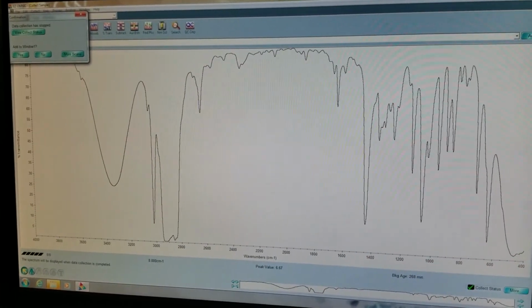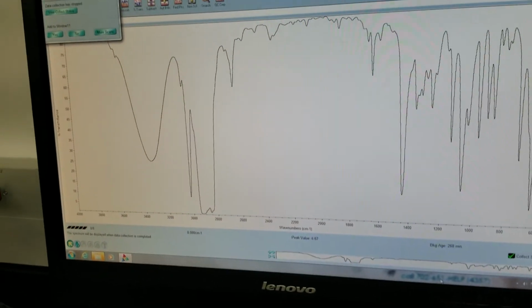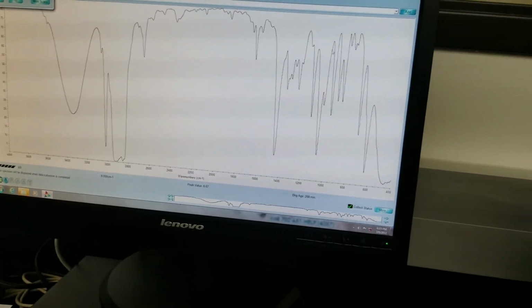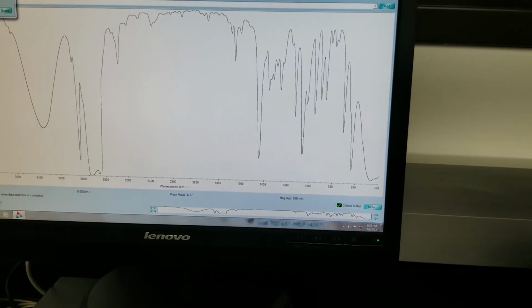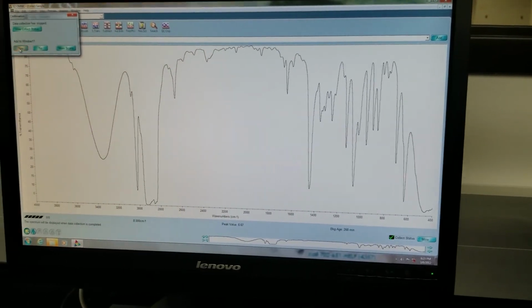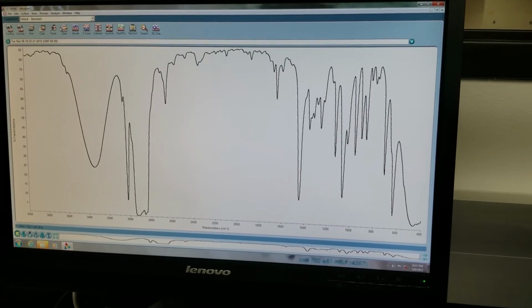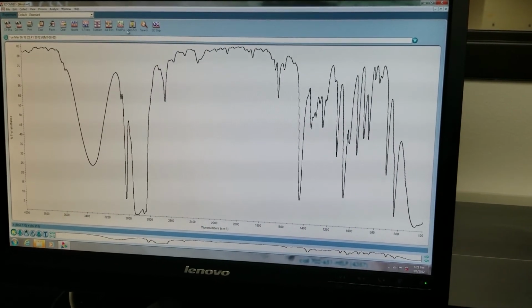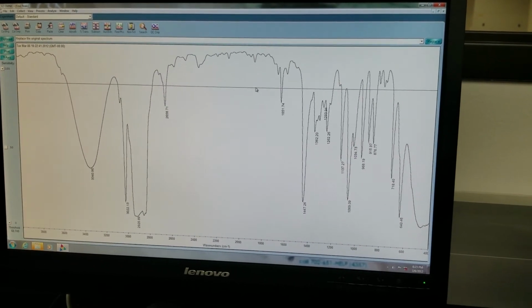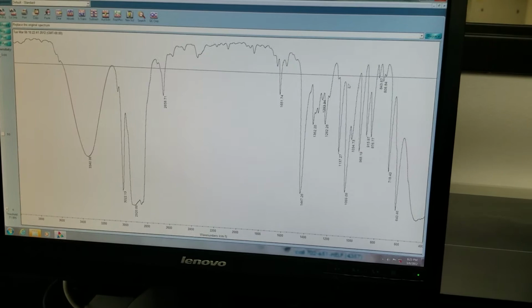And voila. We have a little bit of oversaturation there, but I think we're fine. And it says add to window. So yeah, let's go add to window, we like it. Now if we wanted to, evaporation would get this tone up, but I think that's sufficient. We want to come in here and find our peak find, which is right there, so I'm going to hit that find peaks. We're missing these little guys up here, so I'm going to click up there. If we really want to get those ones, we can get a couple extra.